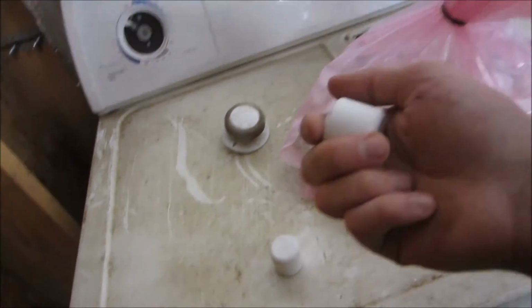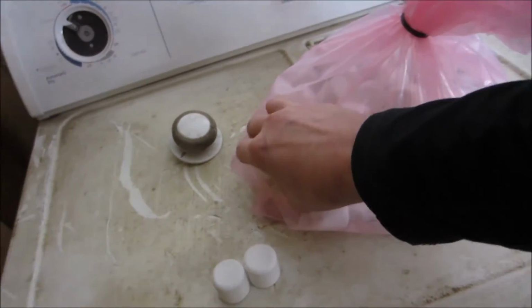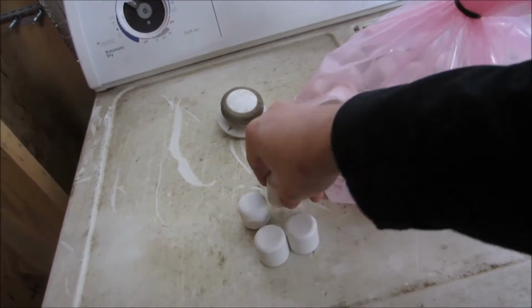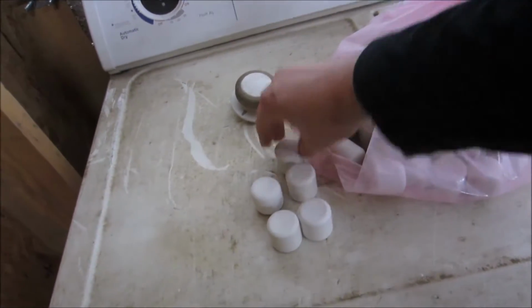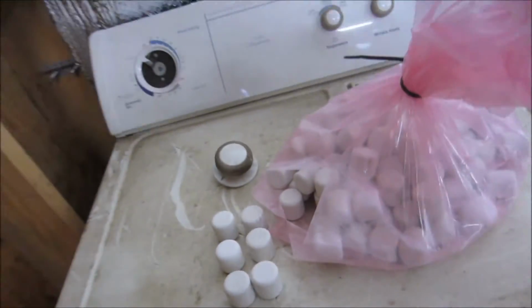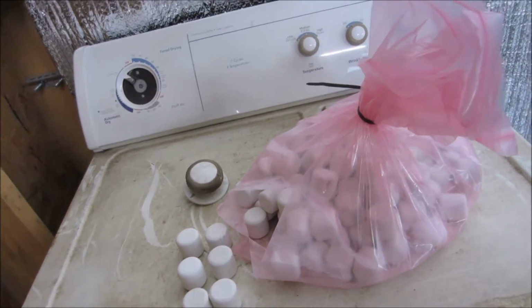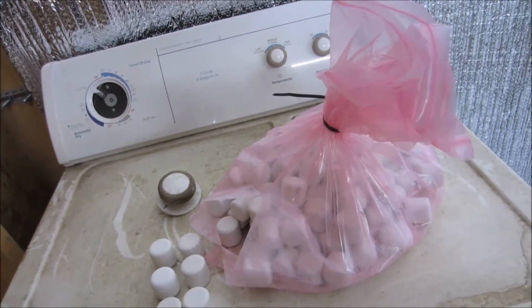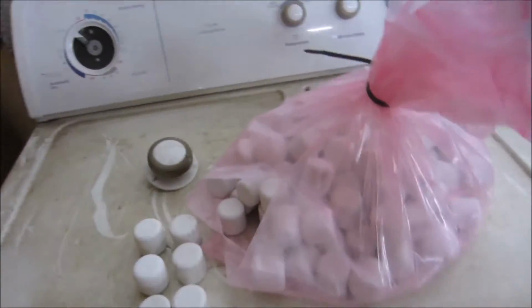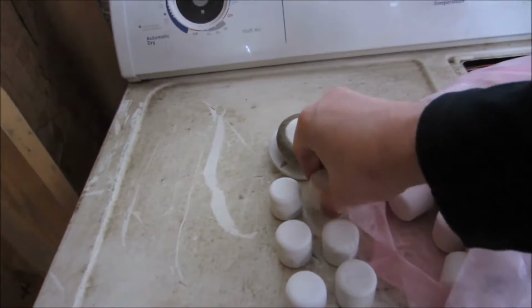Anyway, this stuff was about $50 including shipping for 20 pounds, and that is about the cheapest aggregate I could find. Aggregate slash substrate. Short of lead. I didn't want lead because not only will it just kind of be messy, it's also kind of soft. And the worst part is it will dope my end results, and I don't want that to mess with my findings when I'm doing some research on various carbon structures and that sort of thing.